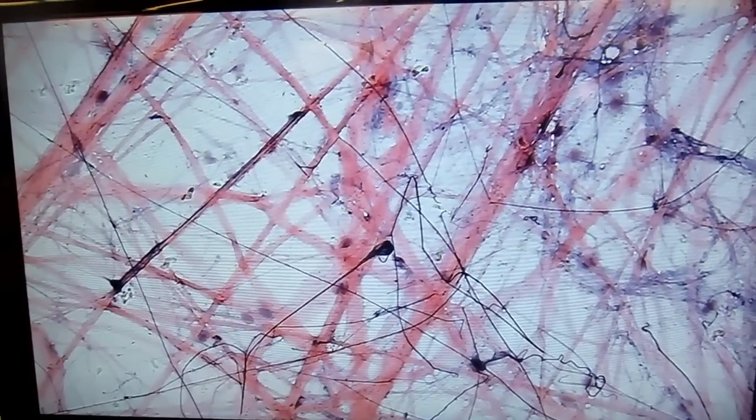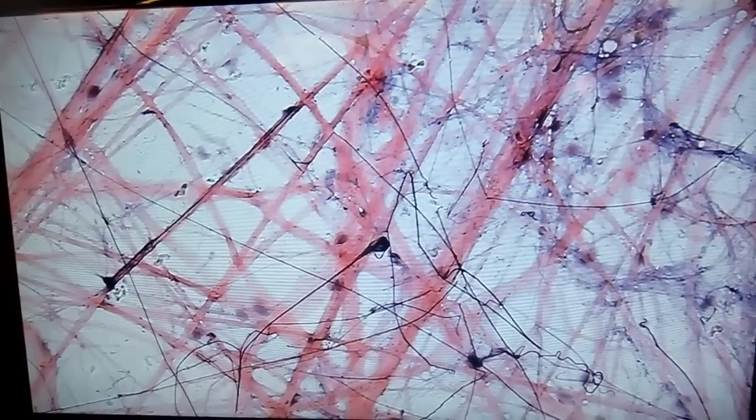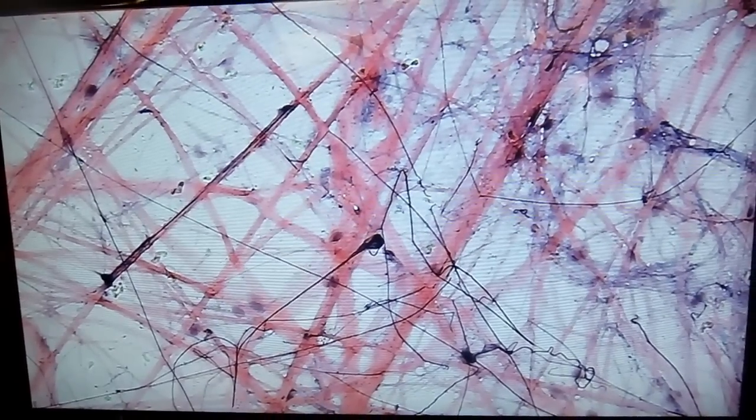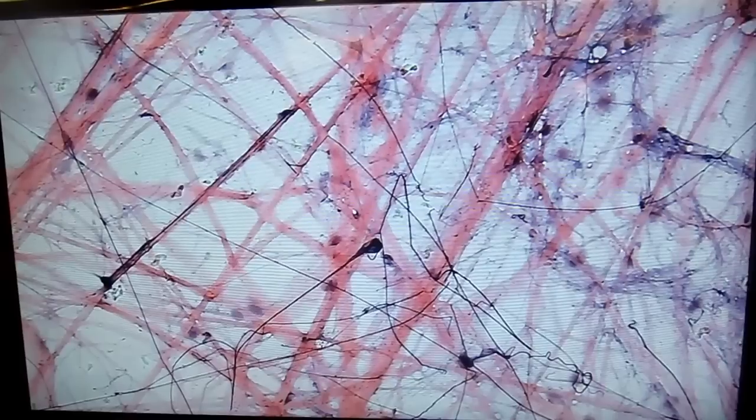Now, the big, thick, pink fibers that you see in here are collagen fibers. And collagen fibers are one of three types of fibers that are found in the extracellular matrix.